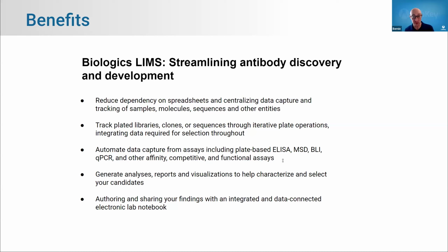Those sequences themselves have a sequence identity based on their amino acids, and we will help maintain the uniqueness of those things so that as you go through the discovery process, if you find that you actually have two of the same sequence or two very similar sequences, it's very easy for you to choose just one of them and continue forward.